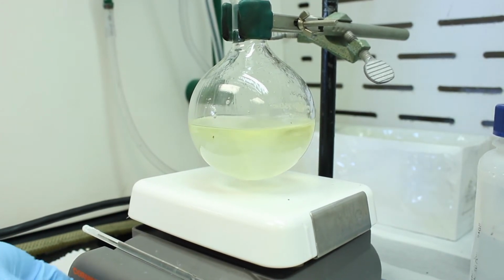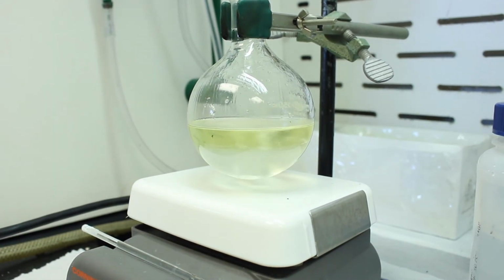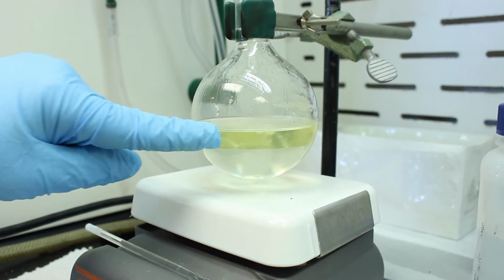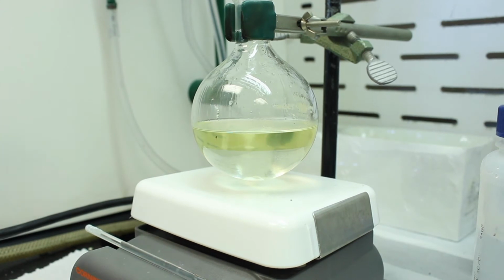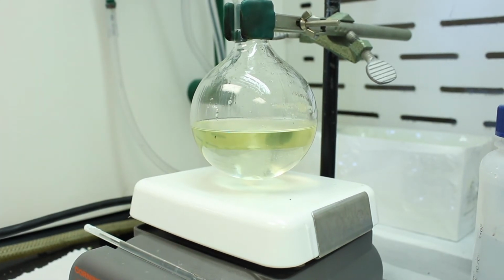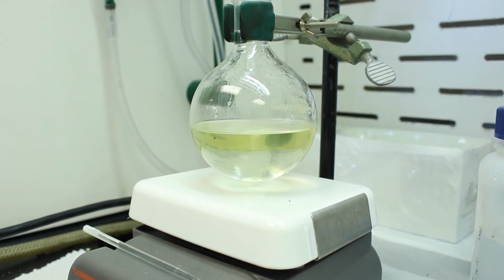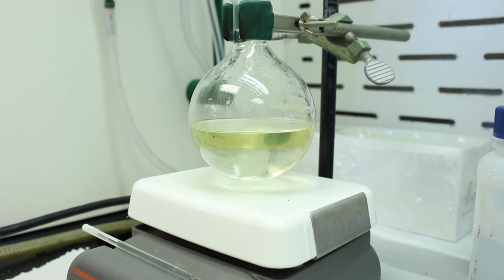Alright, so as you can see, we've added all the hydrochloric acid from the sep funnel, and now we have a very nice biphasic mixture. The top is the ether layer, that's a little bit yellow. That can be due to two things. One of them is the triphenyl cation. In acidic solutions, the OH might leave as water, and then you get a carbocation, which is delocalized among the three phenyl rings. So that might give you the yellow color.